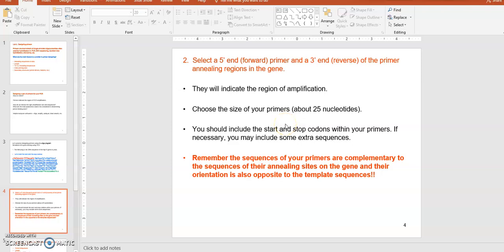When you select two primer binding sites on your gene sequence, those two sites should cover the entire gene. So when the PCR product is amplified you will have the entire gene sequence — that's important. Select the 5' and 3' ends of the primer region in the gene; that is the very important part, so that both primers will cover the entire amplification region.